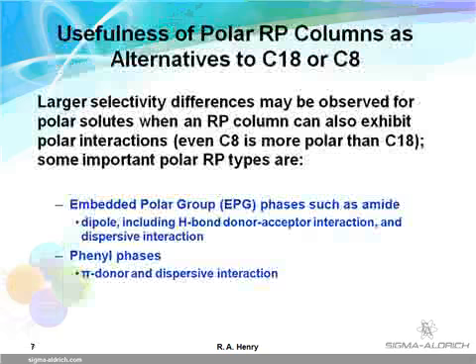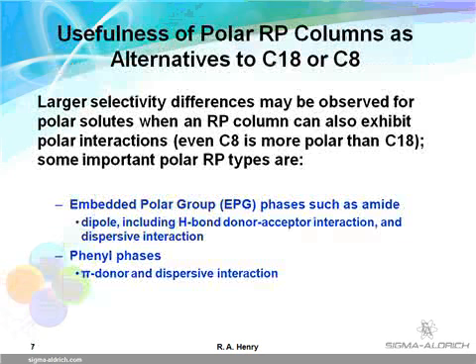The next slide describes some types of chemical interaction that can occur between sample and stationary phase. Nonpolar solutes with alkyl character will usually be retained and separated best with alkyl phases. If a separation looks promising on C18, but still requires optimization, small changes in the mobile phase should be investigated. Changing to a C8 column should also be investigated.